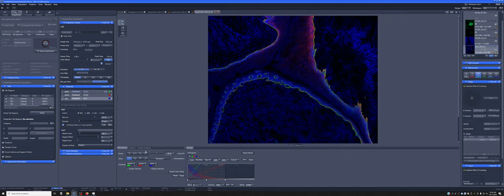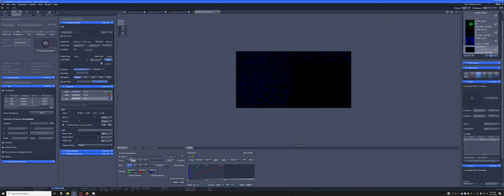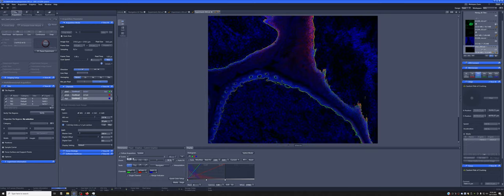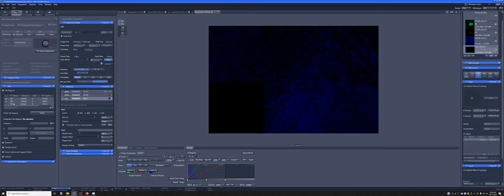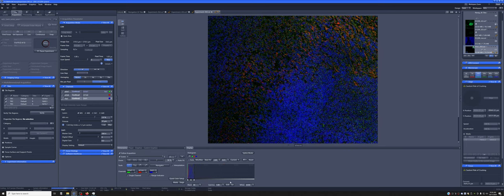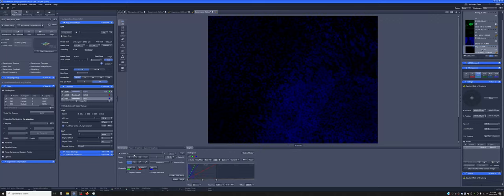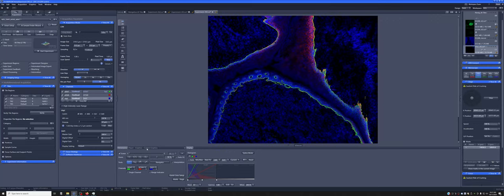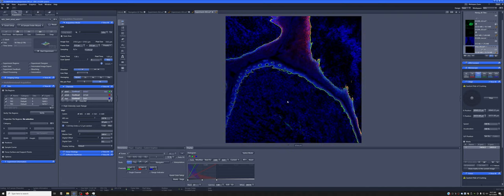So this is the first one. And you can see that when it transitions to the second one, you'll now have a scene slider here, because that's how Zeiss names these different locations, these different tiles. It calls them a scene. So I'm going to say follow acquisition. And so we have that one and this one, which is much dimmer and where there appeared to be no staining on the other channel. So I don't have a good idea of what this is supposed to look like. This is just a sample that someone from the Williams Lab kindly donated.